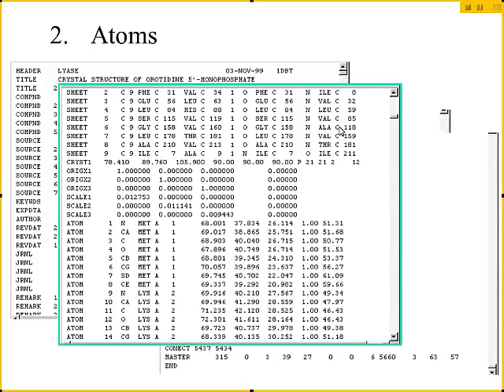Now, each position in the side chain is known by a Greek letter. So the first position is alpha, beta, gamma, delta, epsilon, and then zeta. And so the second part to the atom name is the position. A for alpha, B for beta, G for gamma, D for delta, E for epsilon.